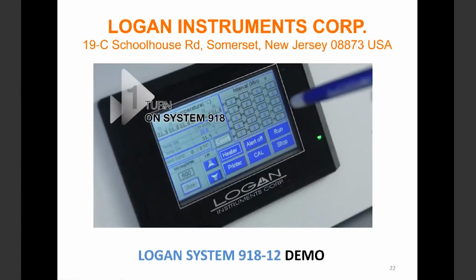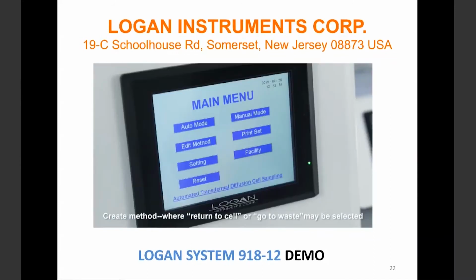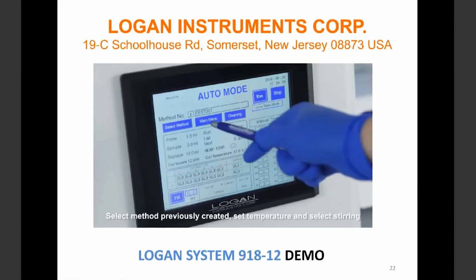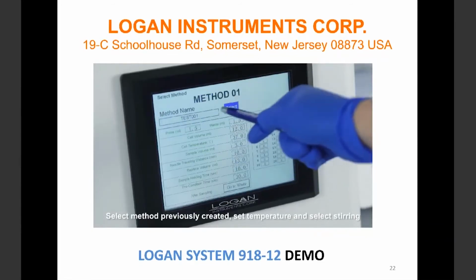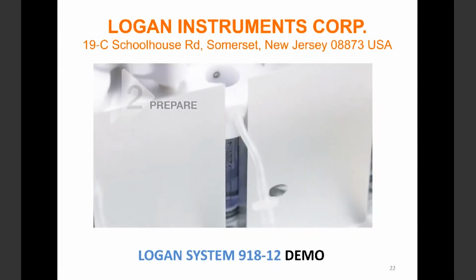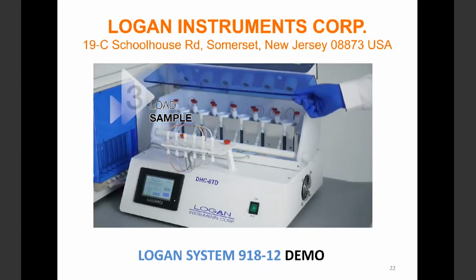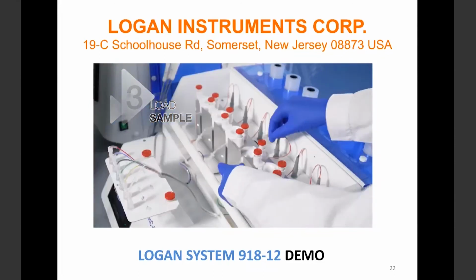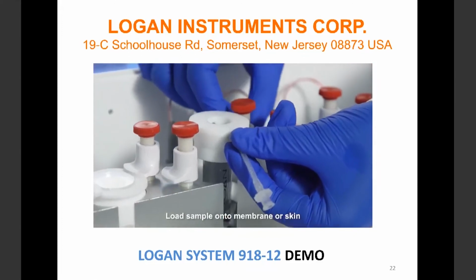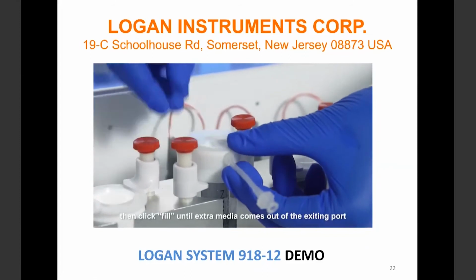Step 1. Turn on System 918. Create a method where return to cell or go to waste may be selected. Select a method previously created. Set the temperature and select stirring. Step 2. Prepare. Fill the cells to about 90% of the total volume. Step 3. Load sample. Load the sample onto the membrane or skin, then click Fill until extra media comes out of the exiting port.